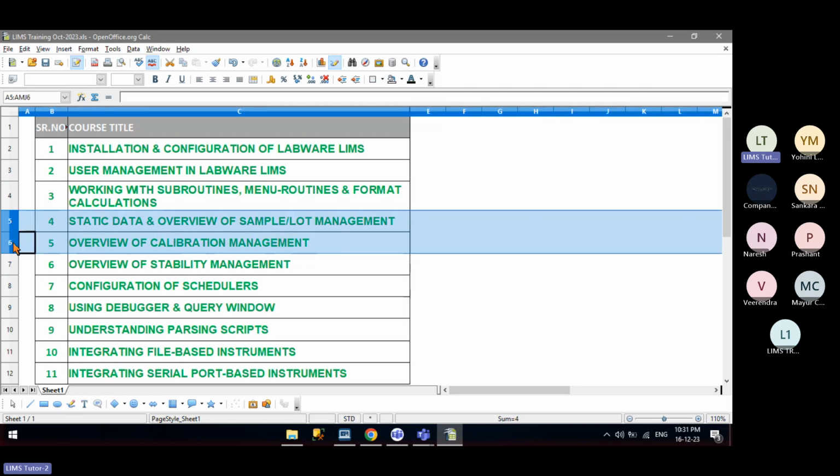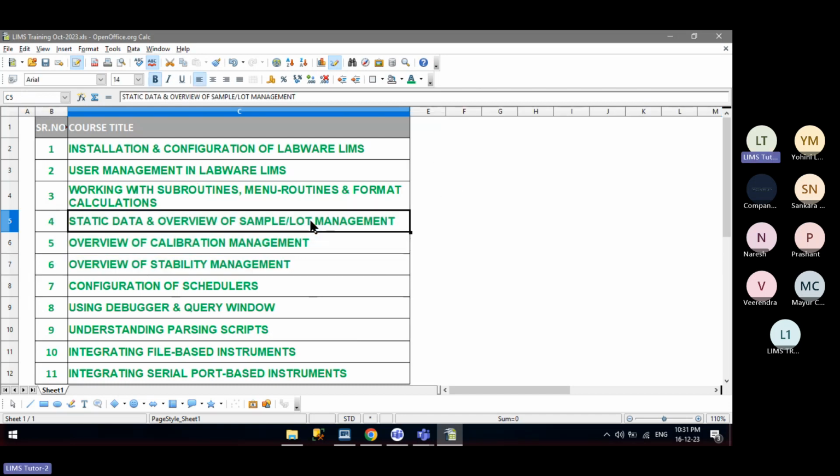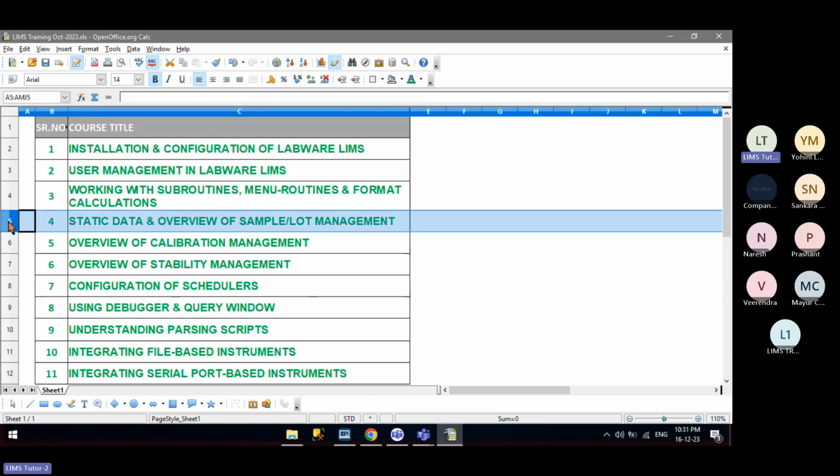Now inventory can be covered in lot management. We can show you some part of inventory, but not completely how inventories are created and how inventory management is handled. But yes, some areas we can show briefly, because inventories are covered in all 3 modules.